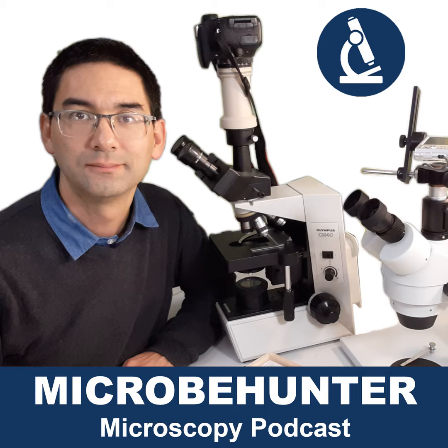And the reason is not that the current cameras are not good enough. Okay, that's not the point. The point is that drawing allows you to combine different images into one typical drawing. Let's say if you want to draw a cell for a book, for an identification book, or some other specimen.